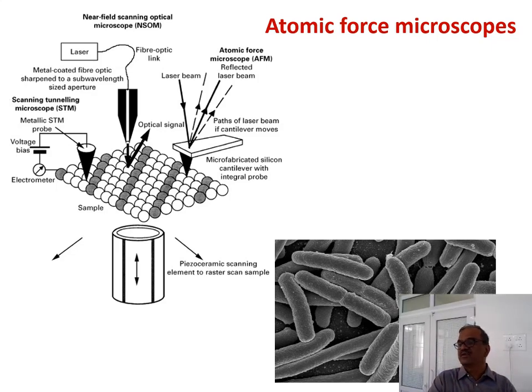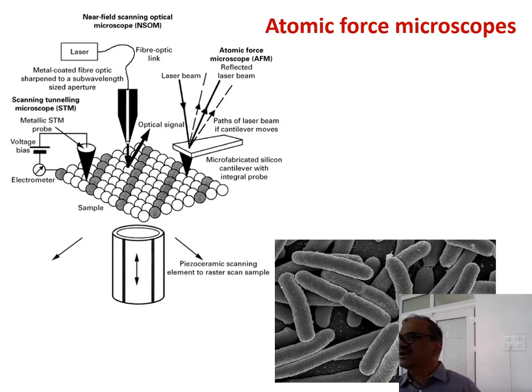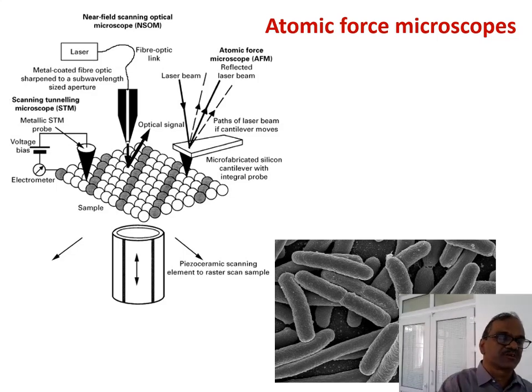So this is the highest advancement now, atomic force microscopy. But is it possible to take our finger and observe it under an atomic force microscope? It is not possible. For very small, very thin objects, you have to make a preparation and then observe.